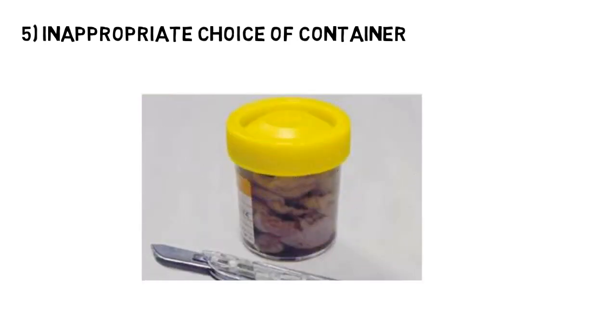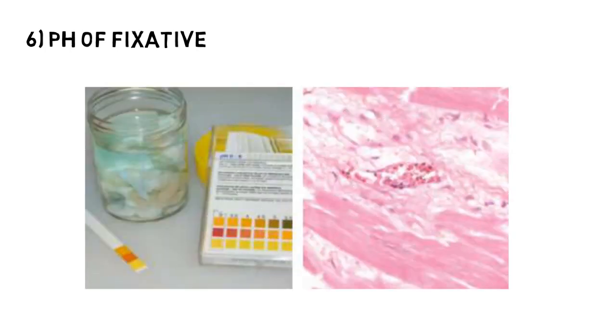Number five, an inappropriate choice of container size can lead to squashing of tissue and it should be rejected. Number six, check the pH of fixative. For example, if formalin — the most commonly used fixative — is used at an acidic pH, it rapidly produces formalin pigments by reacting with hemoglobin. So bear in mind, if the pH of the fixative is disturbed, it should be rejected.